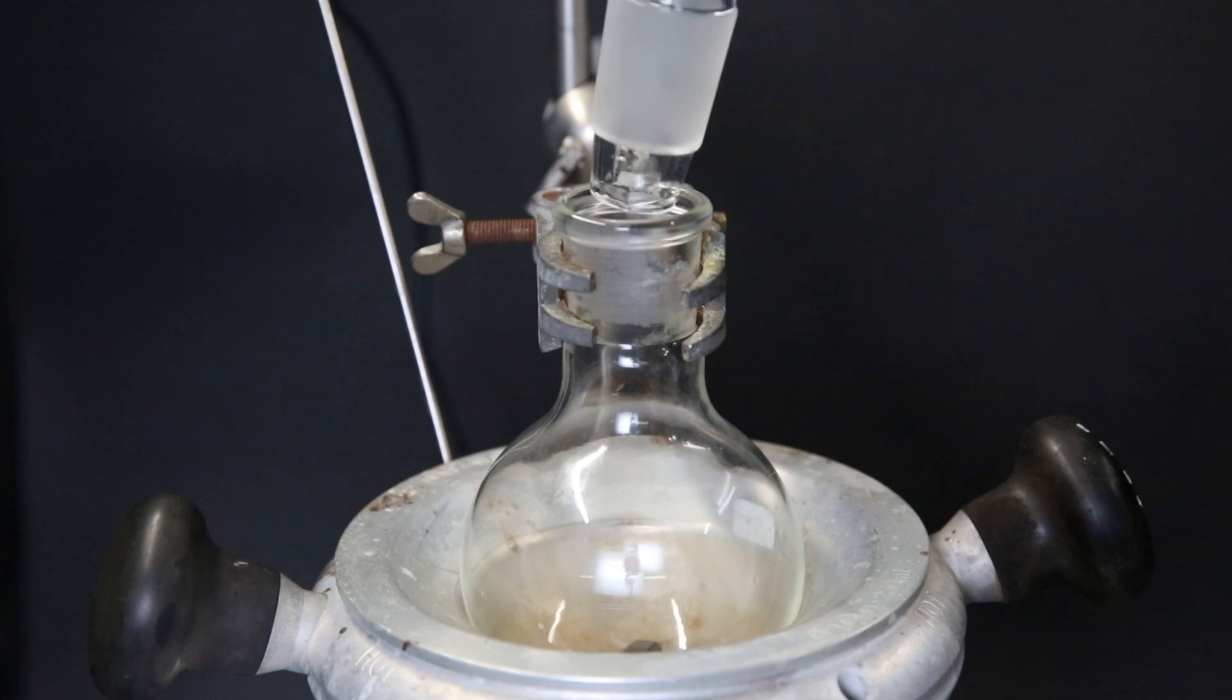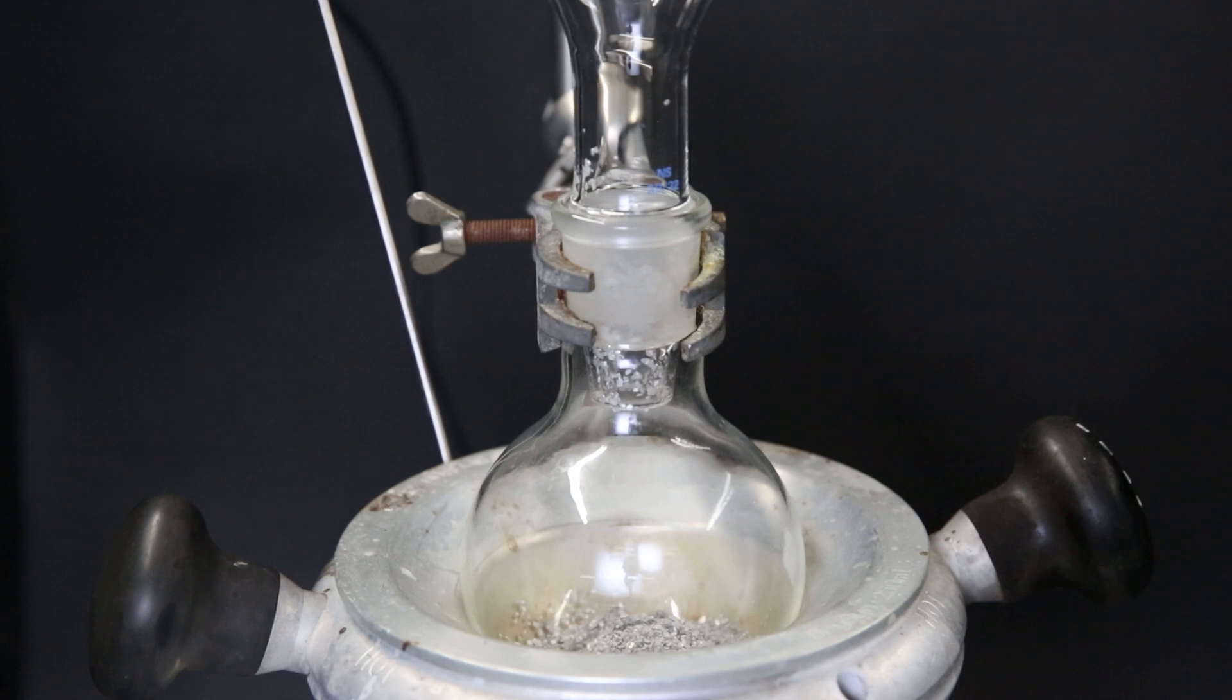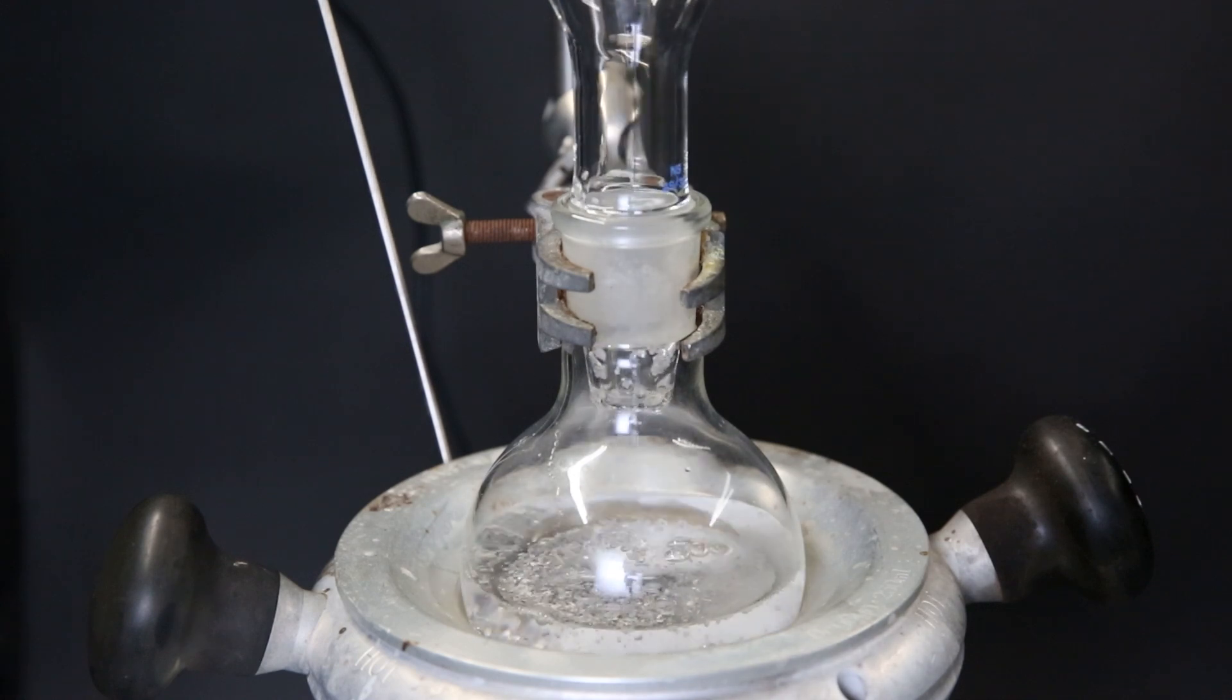To start off I set up a flask and add 14 grams of magnesium turnings, then 20 grams of sodium hydroxide on top. As the catalyst for this reaction I add 3 grams of menthol crystals and 150 mils of paraffin oil.